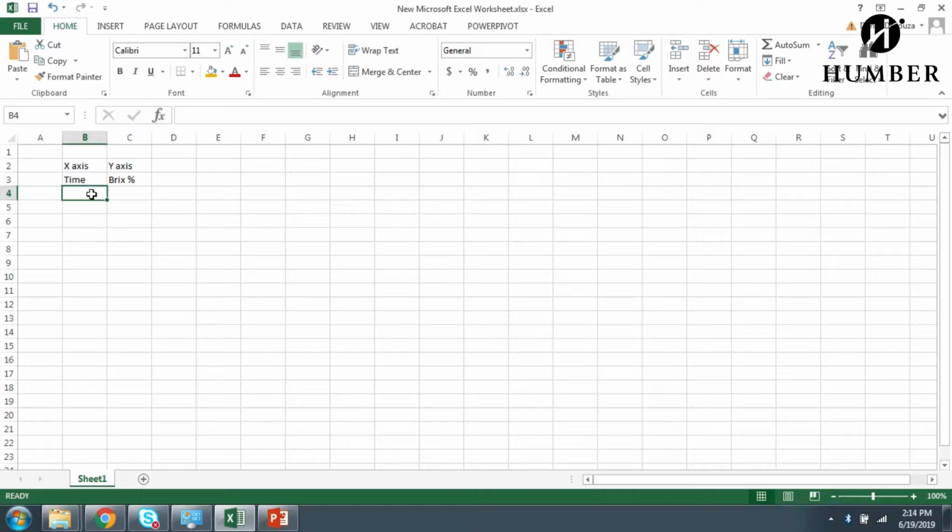If you recall, at 0 time the value of our Brix reading was 29.5, and then at 30 minutes the Brix percentage went down to 8.6.